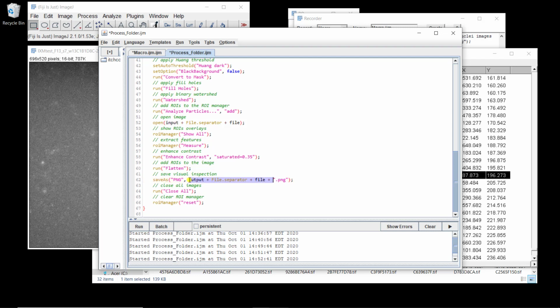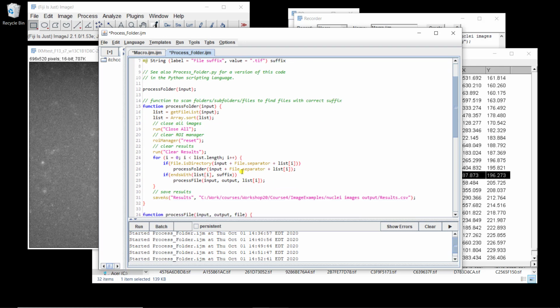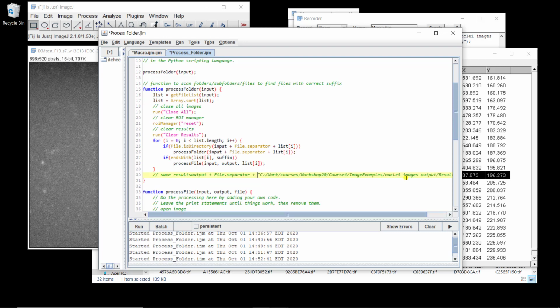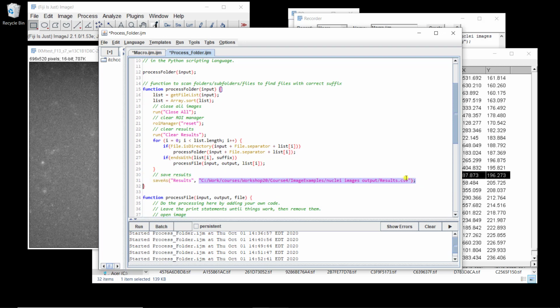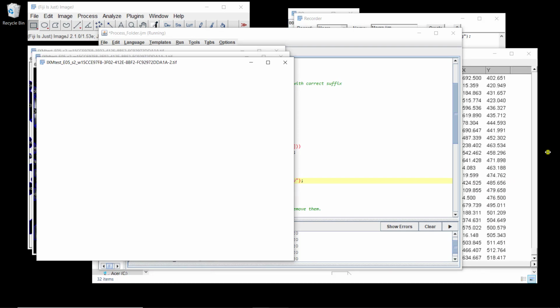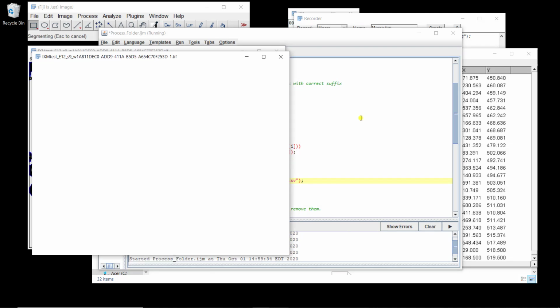except that, so that file, we want it to be in the output folder. So we would do, sorry, something like this, and then let's say results.csv, and just if you want to check if it works, we can just run it again. And now we're gonna save the results directly in the output folder.